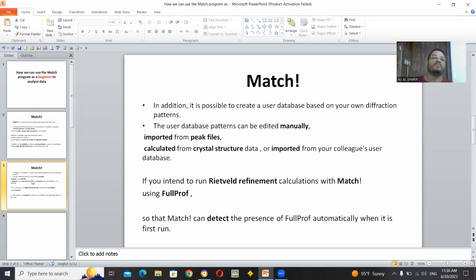By working manually we can analyze our data better and minimize the impurities better. We will see a line that shows the comparison between our data and the program data, and it must approximately follow our data to be acceptable.